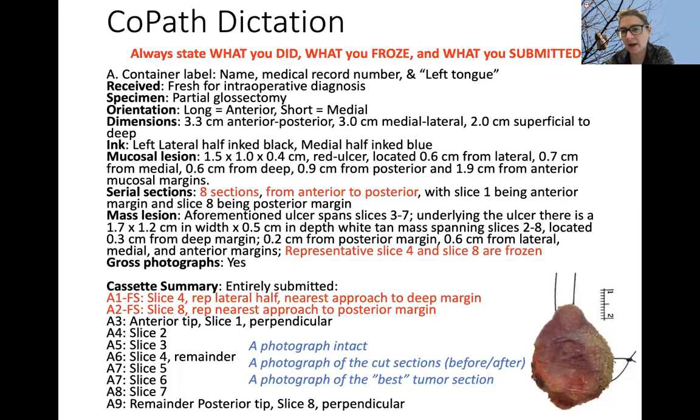You can do it after the fact. You don't have to do all of this right up front. But if you're going to freeze something that's very, very close to margin, I would advocate you take a photograph of it before you freeze it, so we know what it looked like and why you chose that particular section. I know it takes up some of your time, but the ENT surgeons aren't generally very anxious about time because they're doing neck dissections or other things. So if you encounter problems, just let me know, but this is my general gist.